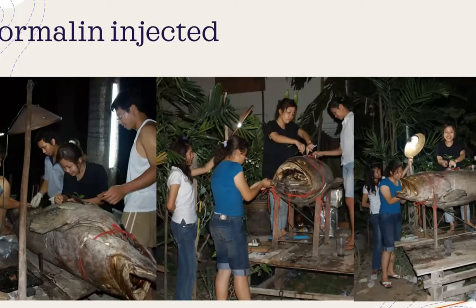Normally, for a big fish, sodium benzoate is not so good, because the big one cannot be preserved. When you use sodium benzoate, you use a small fish. After you remove all the meat and it is already fixed, you can put them in the sodium benzoate solution, around 15 minutes for the small one, and around 30 minutes for the bigger one.